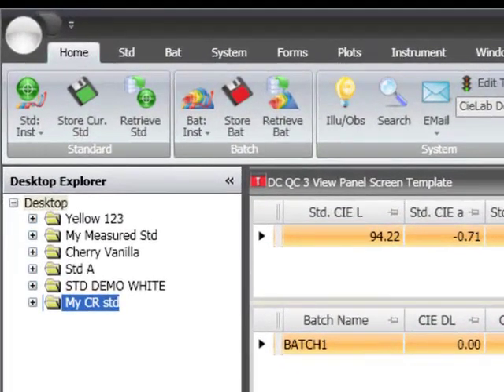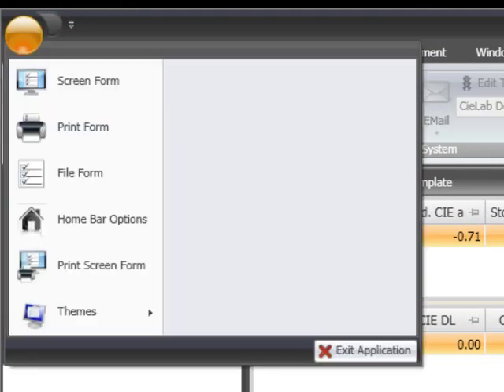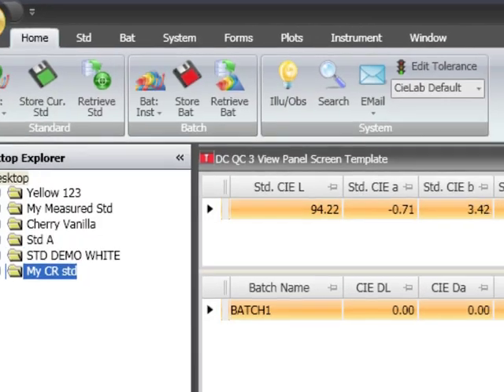We use the Home Bar options available in the Tools button to edit the Home Bar. Clicking on this opens the Edit Home Bar dialog box.